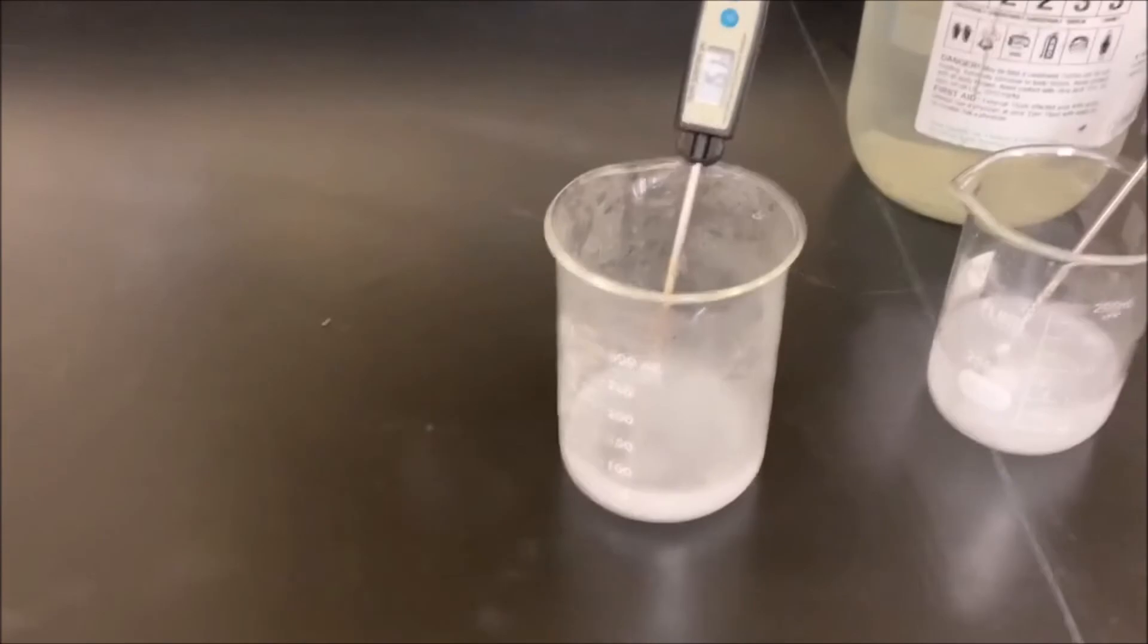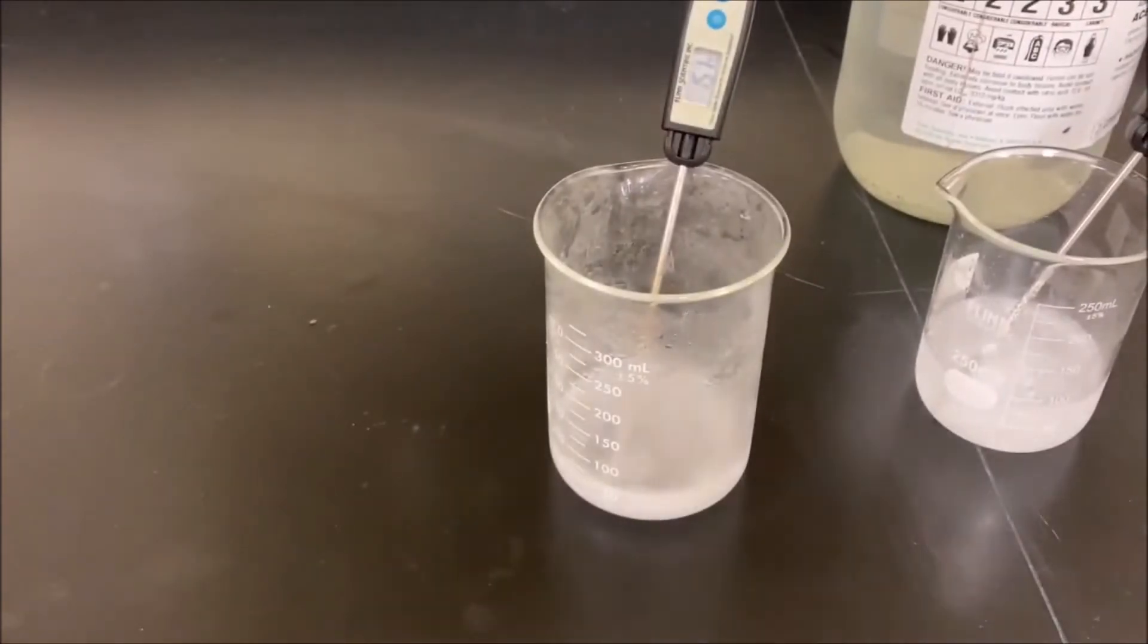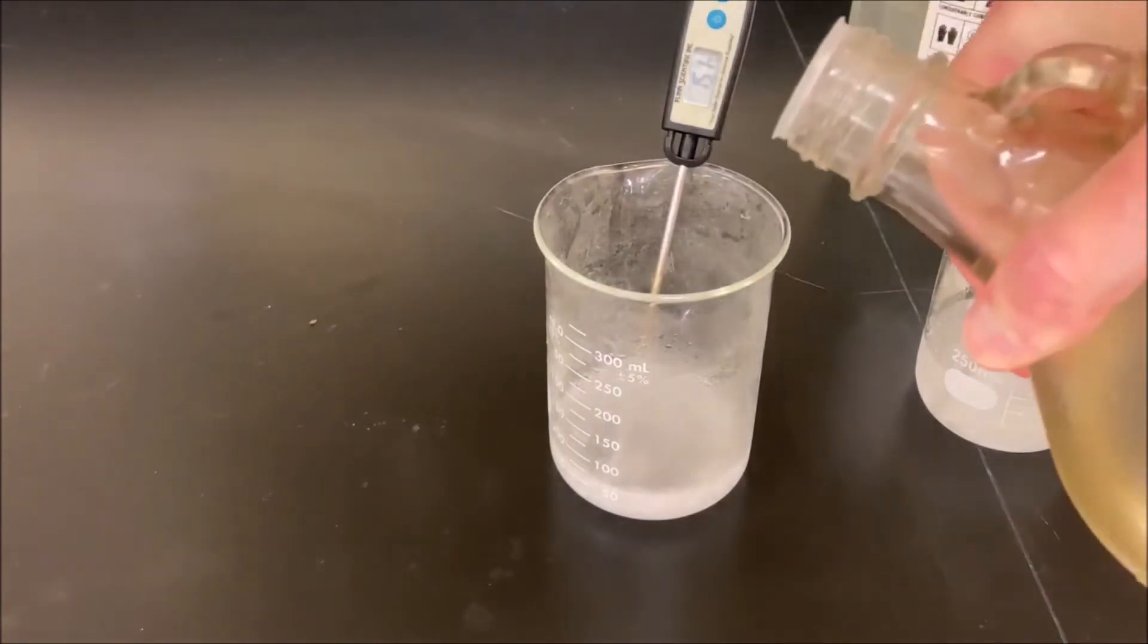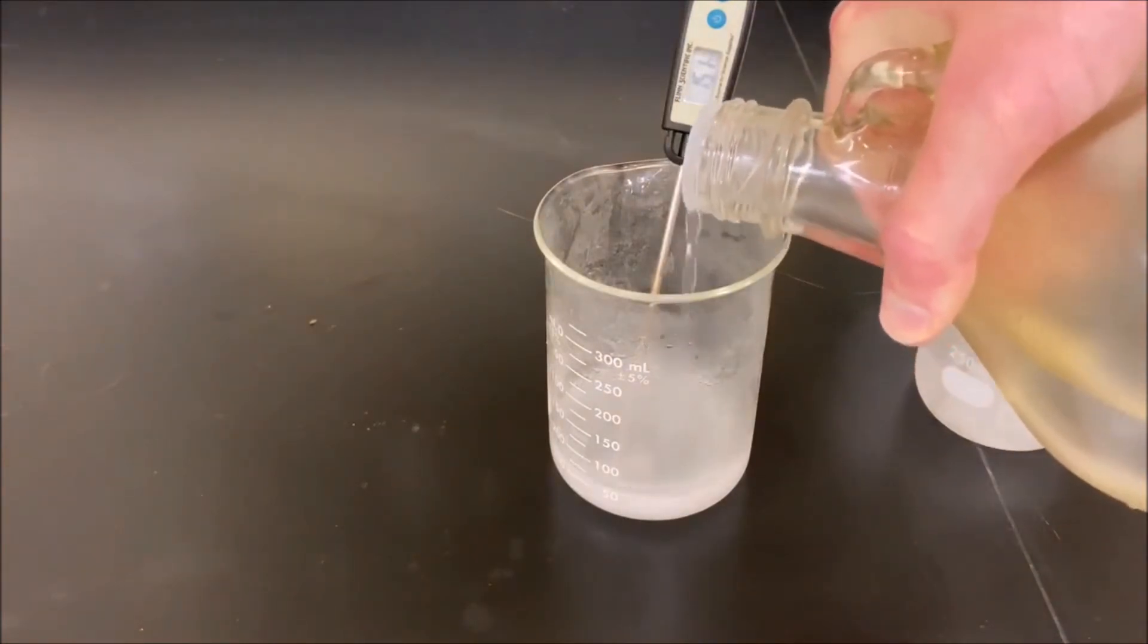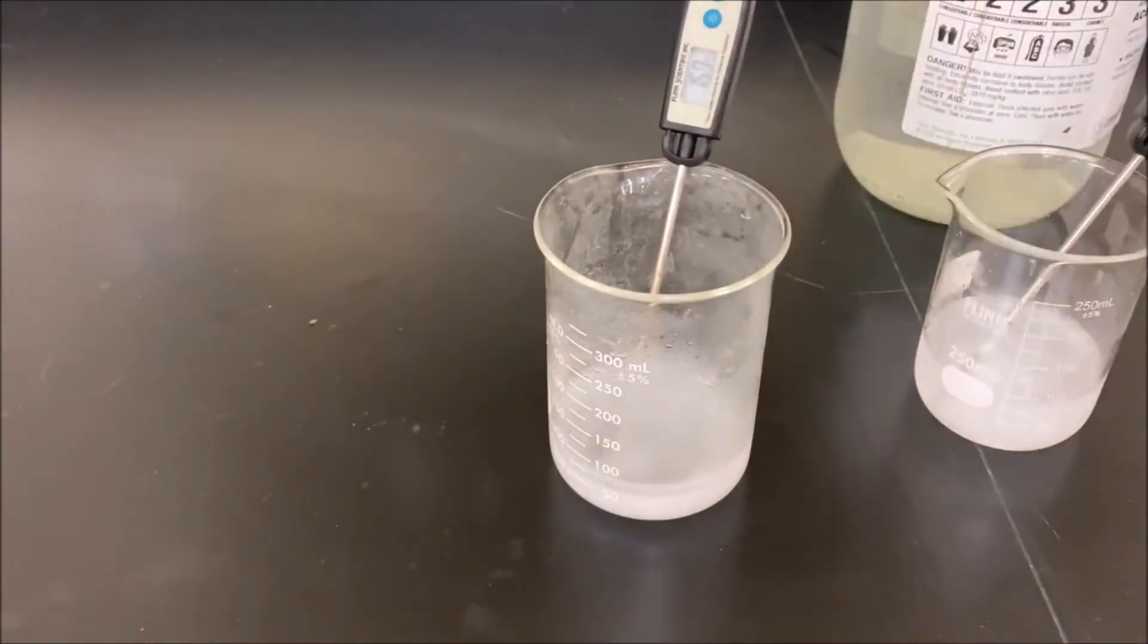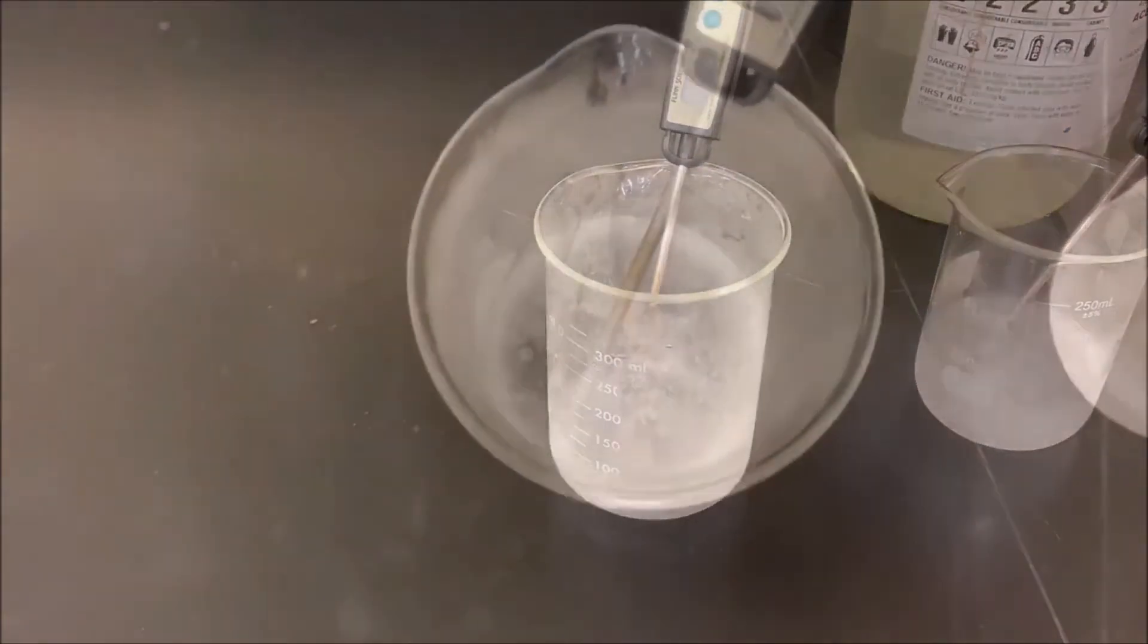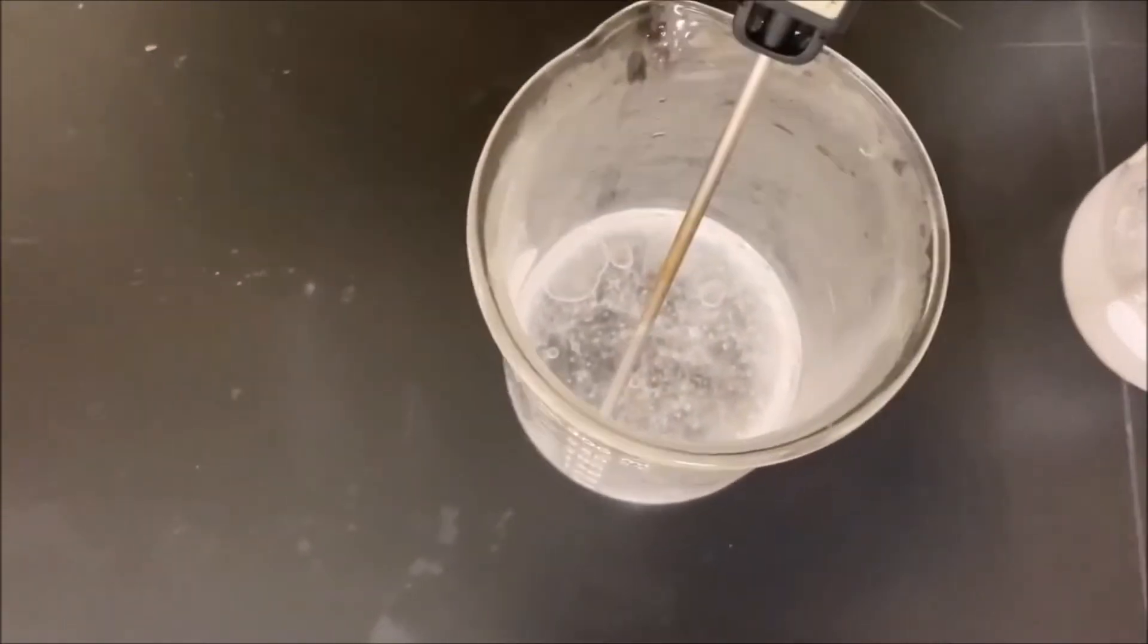So we're going to go ahead and take this and add some solution of baking soda to it, and potentially that will melt the acetic acid and potentially we'll see some more bubbling, but we'll see. I'm going to put that right on top.